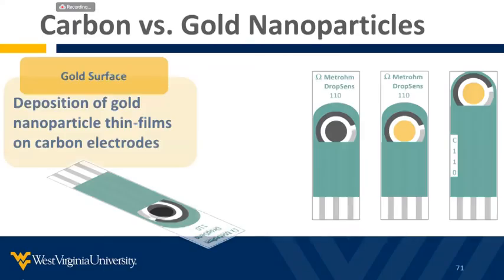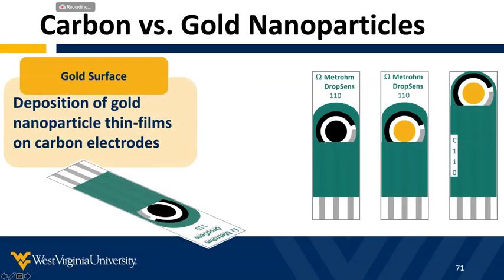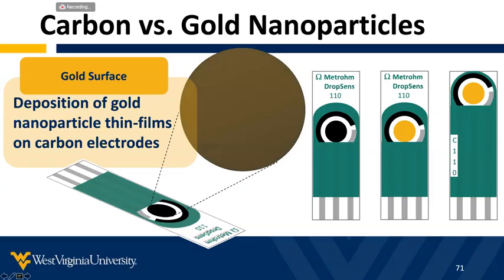Although this technique fits for purpose, we are still finding better ways of using electrochemical sensors. So we are enhancing the electrochemical signal with nanoparticles. The use of nanoparticles increases the surface area of the electrode and therefore improves the current response.